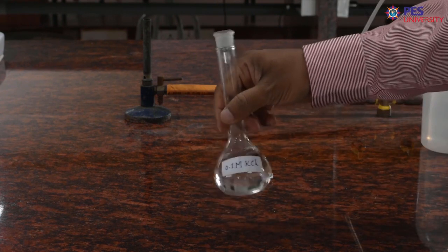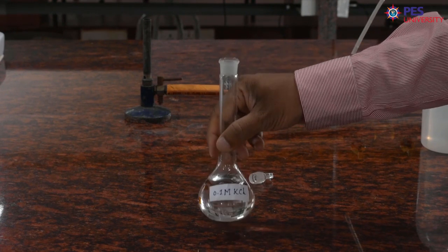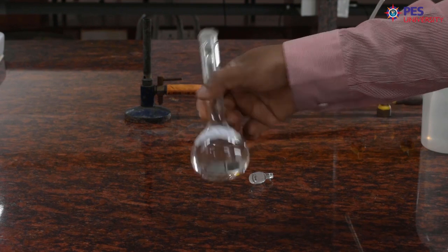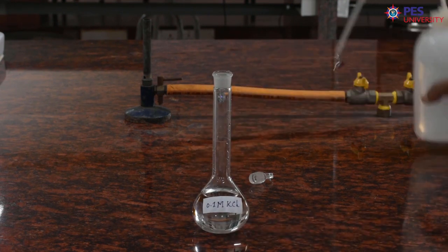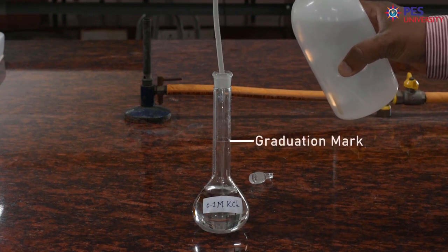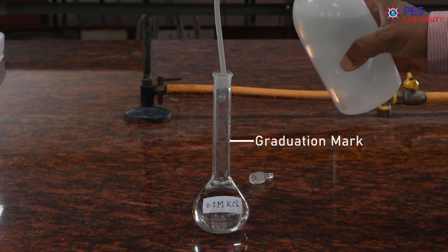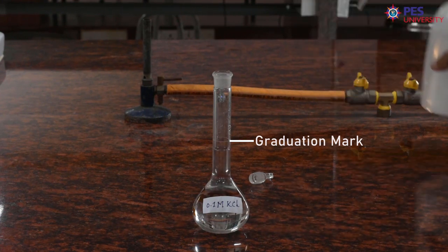Then swirl the flask to dissolve the KCl crystals. Then add water just below the mark by using this wash bottle.